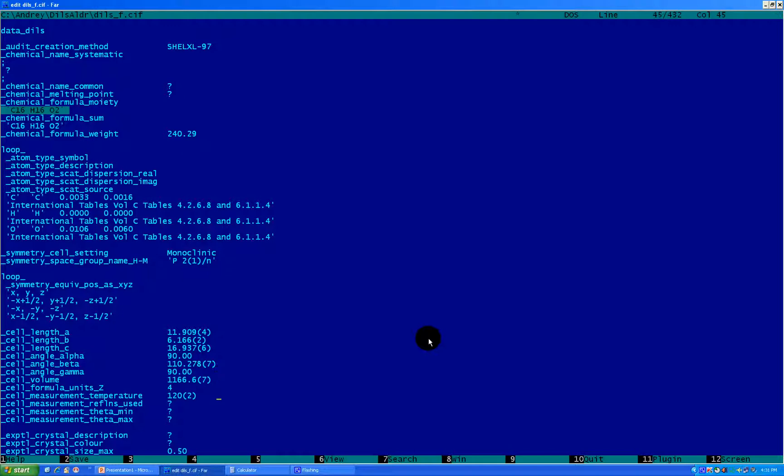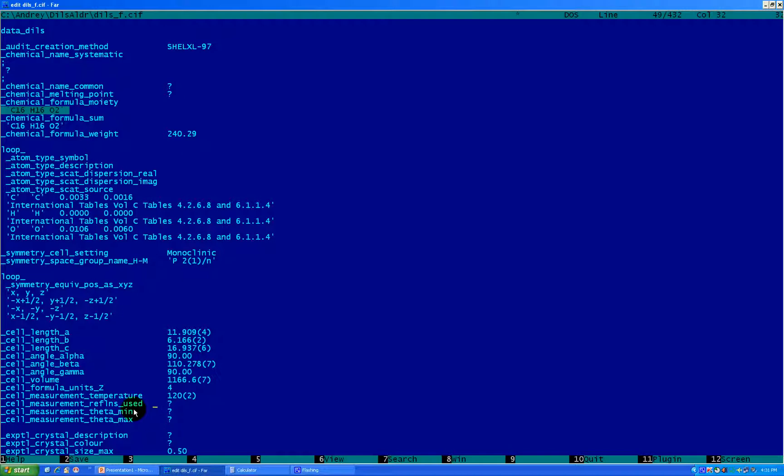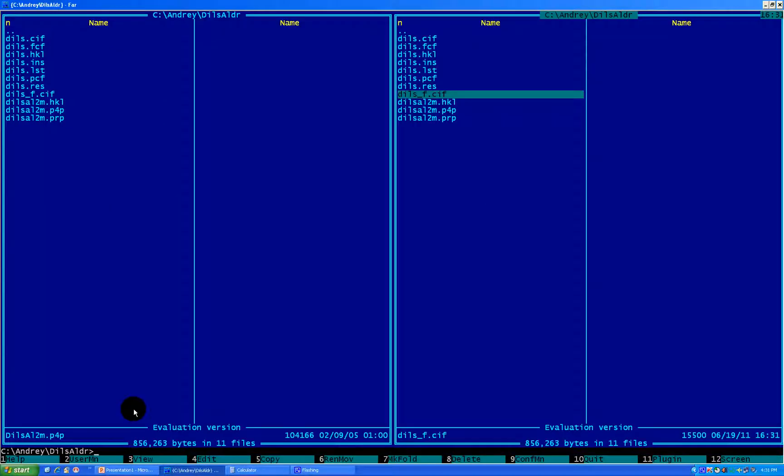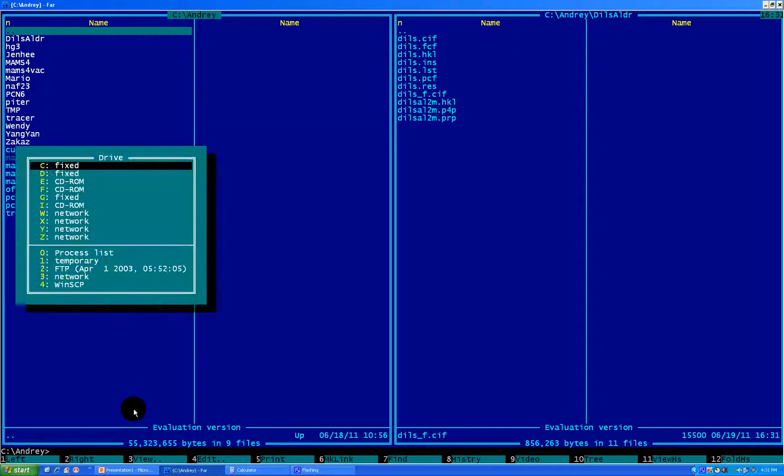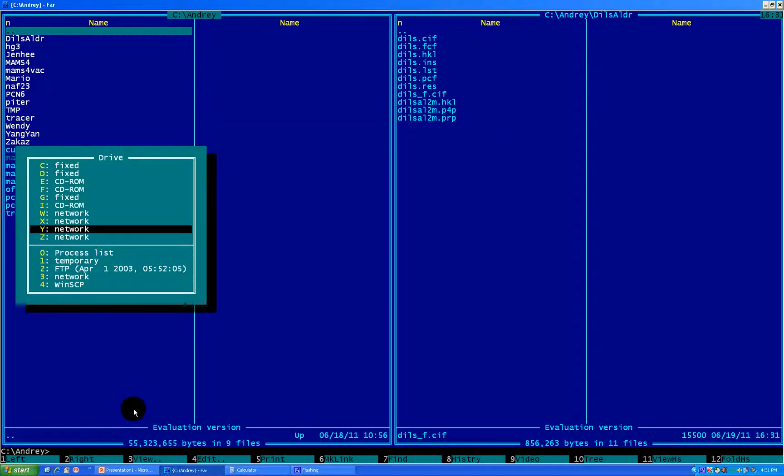Next thing what you see is cell measurement refinement used, the cell measurement theta min, theta max. What is this? Well, these guys are asking you for statistics. How many reflections did you use to index your unit cell and refine your unit cell? And also, what the theta minimum and theta maximum angles for those reflections? Well, where do you take this information? This information you take in the files from files which you used for integration. So let's find one of these files. So I do an escape save. We're saving this file. And I think those files are on my network server. Yeah, here they are.